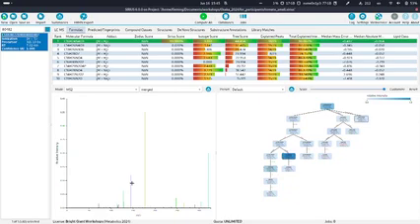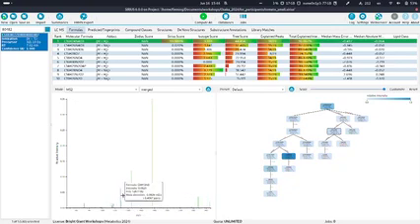Yeah, and you can just move through it if you want. Also, maybe a little bit of a pro tip: if you want to select a very small peak, this might be difficult with a mouse, although you can zoom in also. But what you can also do is just use the arrow keys on your keyboard to switch between the peaks.